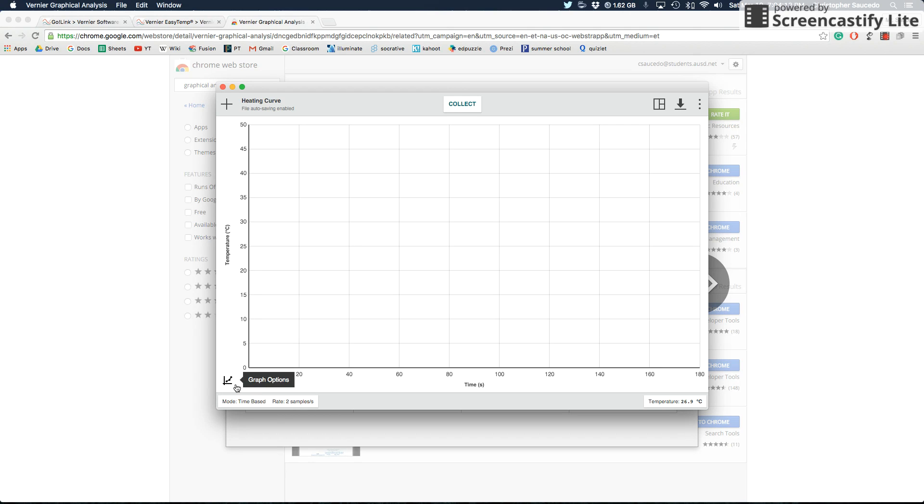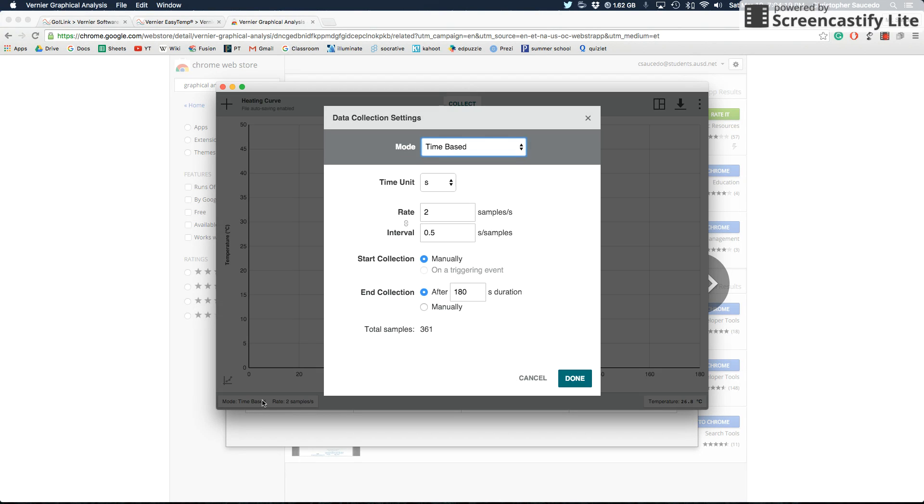The first is graph options. And then you'll see mode, time-based, rate, two samples a second. If you click on that, it'll let you change the time unit at the top. You can change it to milliseconds or seconds or minutes or hours. We're going to want to keep it on seconds.